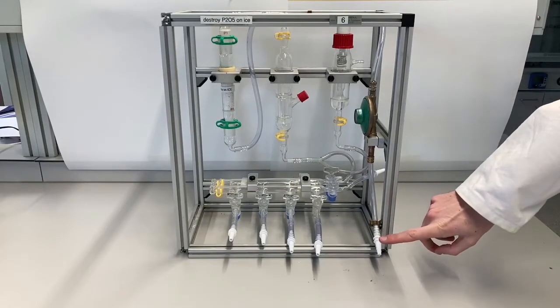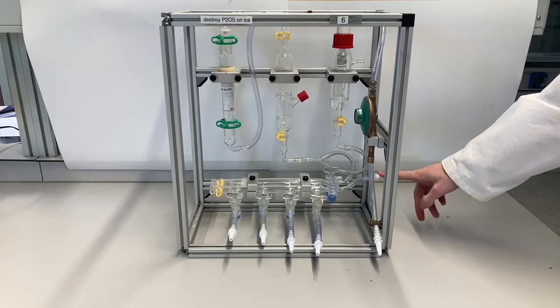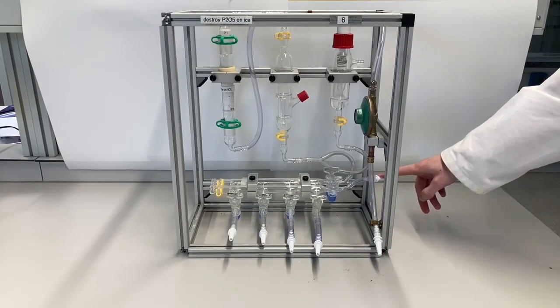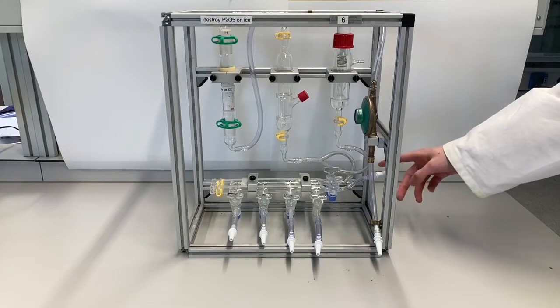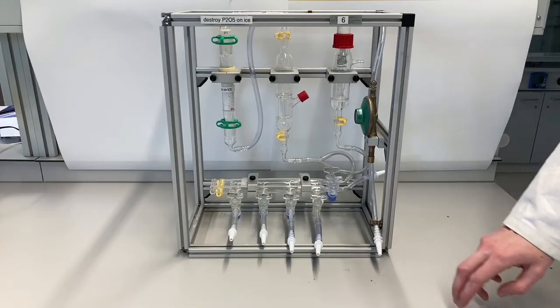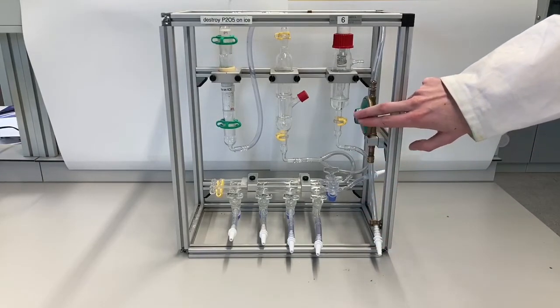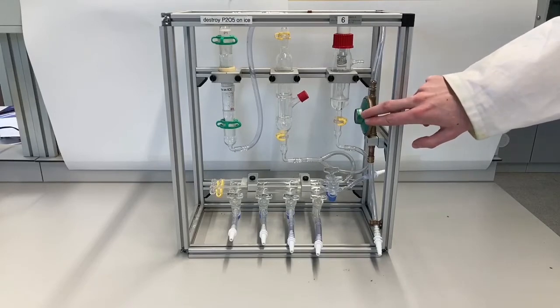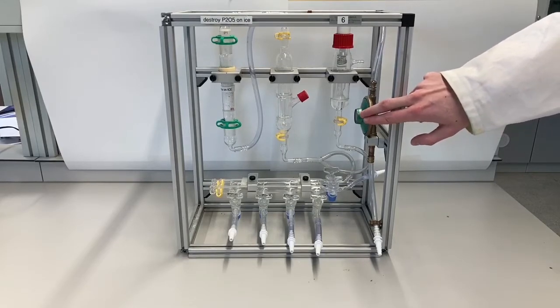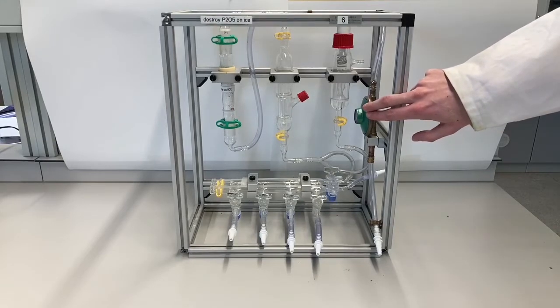At the bottom is the connection for nitrogen from your fume hood, and on the other side there is the connection for vacuum from either the vacuum pump or the vacuum line in your fume hood. The nitrogen comes in and there is a pressure reduction that makes sure the pressure of nitrogen is always slightly above one bar, but not so high that it will blow out your reaction.